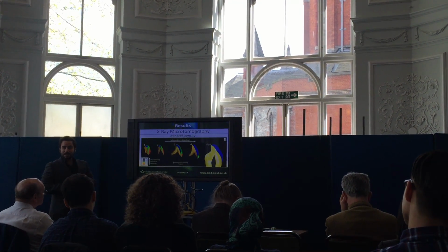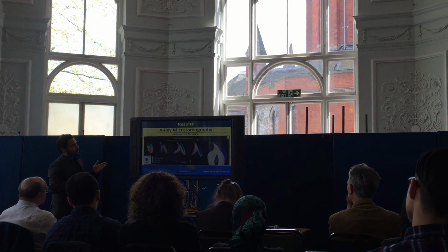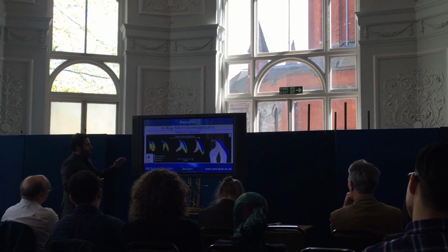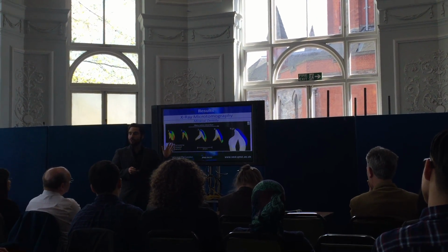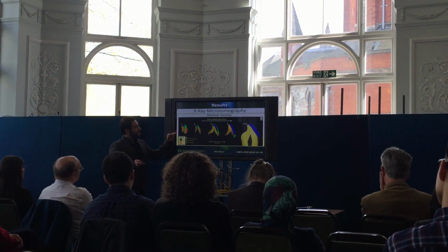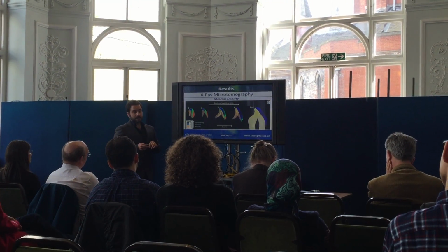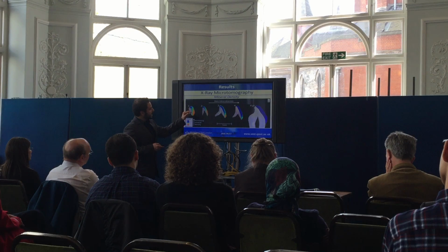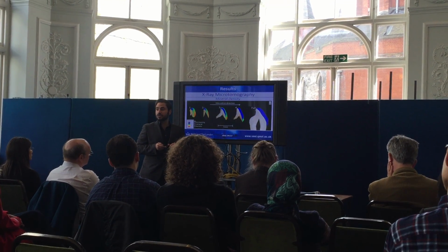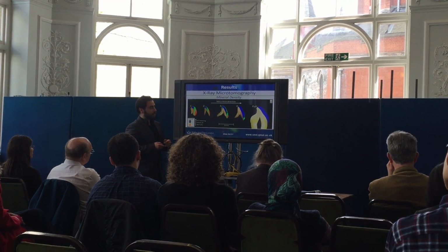This concludes my materials and methods, and now we can jump to results. From X-ray microtomography, I achieved the following mineral density maps, from least developed to most developed, blue being the highest mineral density, red being the lowest mineral density. As you can see here, this confirms that mineralization starts at the cusp and near the EDJ, and then progresses downward and toward the surface as a function of time. Also, the fully developed tooth is the most homogeneous out of the rest.